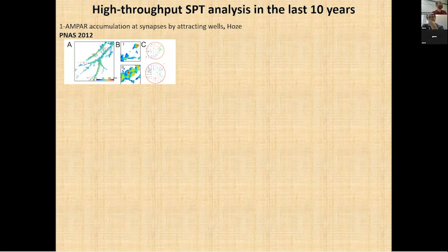Well, that I'll describe. I don't find it, you don't see the pointer somewhere, no? There, over there in the box, you have in the back behind you. Do you see a pointer? Yeah, that will be easier. Yeah, good.